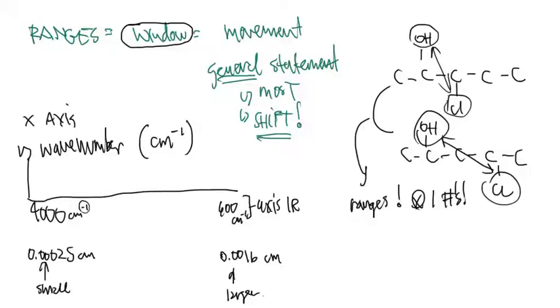So at first glance, it looks like the x-axis goes backward. It looks like they're starting with a bigger number and it's getting smaller, and some people are very confused. Why does it go backward? It doesn't go backward.